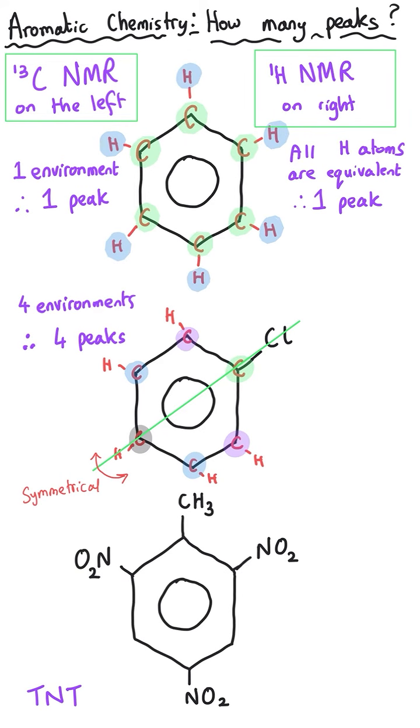The proton NMR would follow the exact same rules because that line of symmetry is still there, but because this carbon atom here doesn't have a proton attached to it, this would not be an environment in the proton NMR because there isn't a hydrogen atom there.